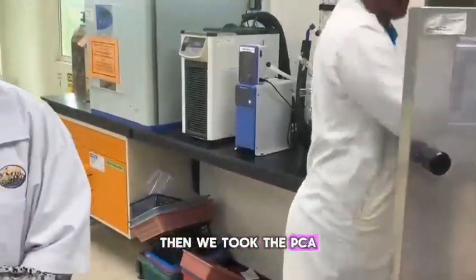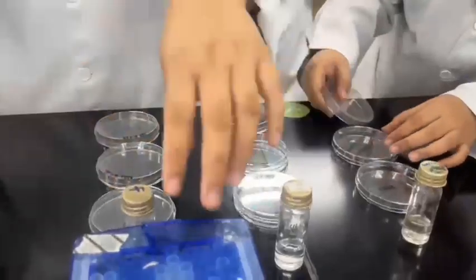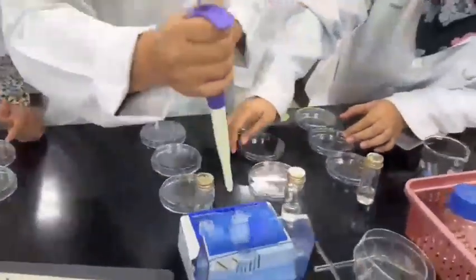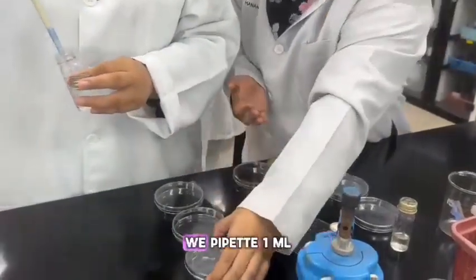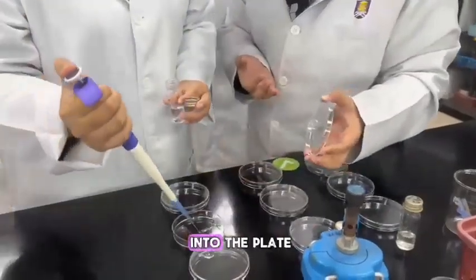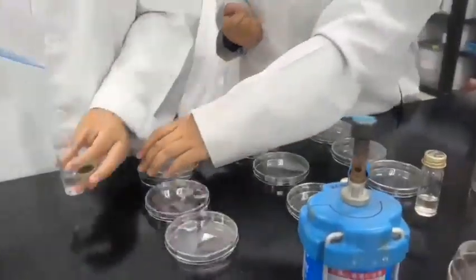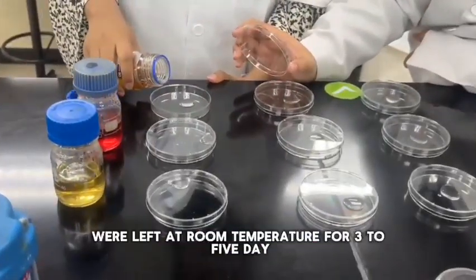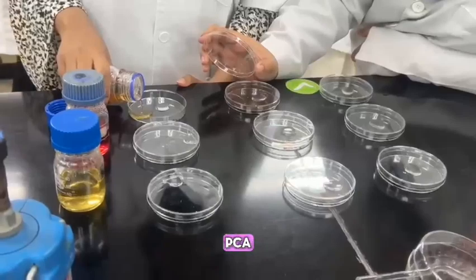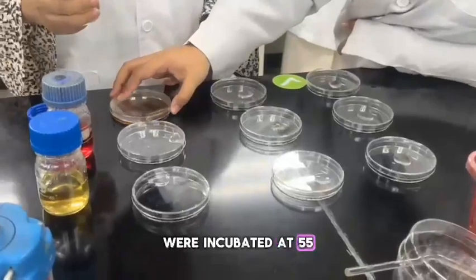Then we took the PCA, the RBC and TGE agar that were prepared by the lab assistant. From the dilution of the homogeneous sample, we pipette 1 ml into the plate. Then we poured the RBC, PCA and TGE agar, whereby the RBC was left at room temperature for 3 to 5 days, PCA was incubated at 37 Celsius for 24 hours, and TGE was incubated at 55 Celsius for 48 hours.